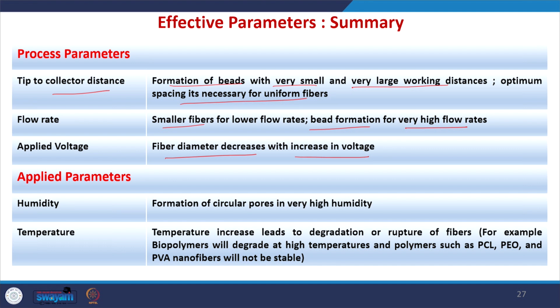Under the applied parameters, the first one is humidity. If the humidity is high, there will be a formation of circular pores in the nanofibers. And if the temperature is higher, it leads to degradation or rupture of fibers.